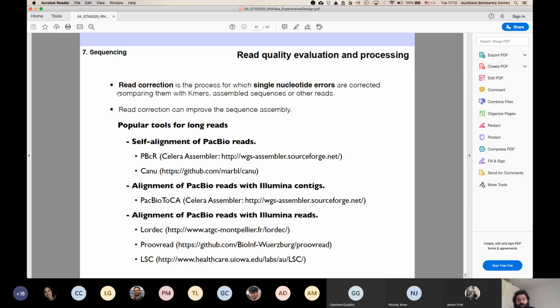The other option, which is the most common one, is you use oligo-dT and it's only going to transcribe the mRNA. But if you use random primers and you have rRNA contamination, the problem is that this rRNA contamination is going to be transcribed too. And then when you are looking into the expression, maybe 20, 30, 40% of your sample is going to be rRNA. And of course, because you need to normalize with all your reads, it's going to mess up your expression. So that is the reason why random primers could be used, and are still used on some occasions, but you need to be careful when you use them.